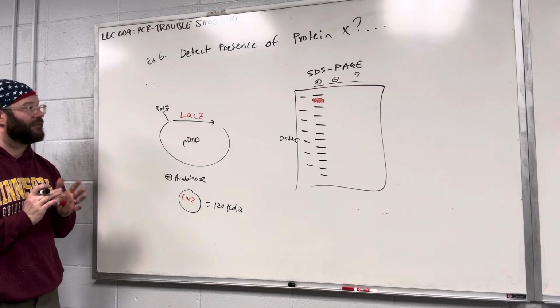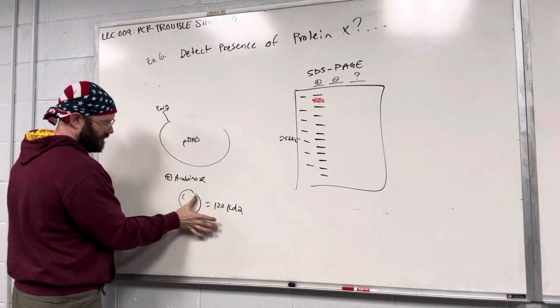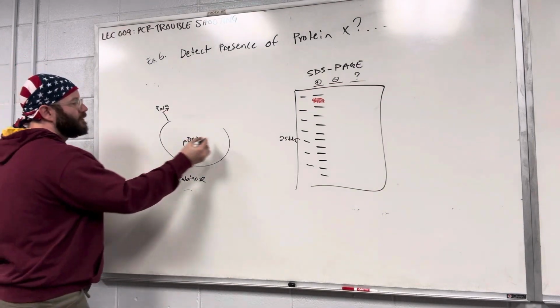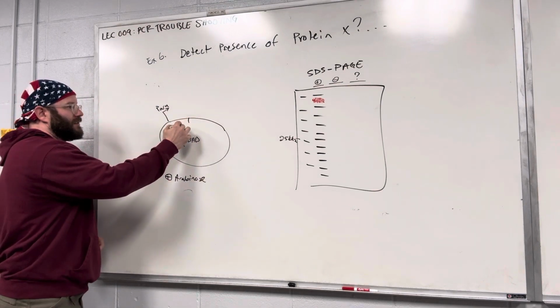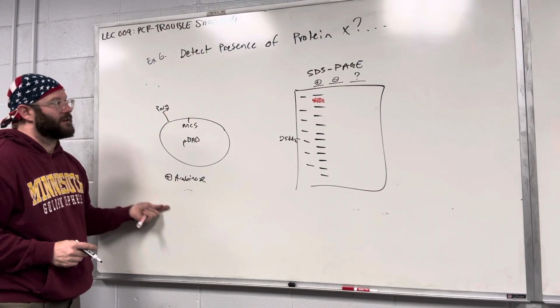Or what could be a negative control? Just the backbone? Yes, that'd be a good one. Okay, so in this case, you have just a sealed backbone, nothing cloned into the multi-cloning site. It's just empty. You add arabinose, nothing would get turned on.